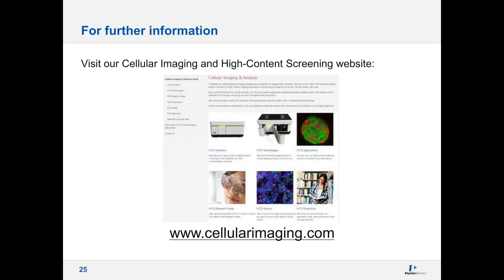It also has to do with how those measurements are going to be made. As I mentioned in my slides, you can collect a series of Z-plane images and you collapse those into a maximum projection image. And that seems to be the way most people are treating 3D image analysis currently, although there are some groups that are actually looking at the volumetric, the voxel space. If the biology warrants it, they're going to need to do that if they need to look at particular objects in three-dimensional space. So it really depends on the model.